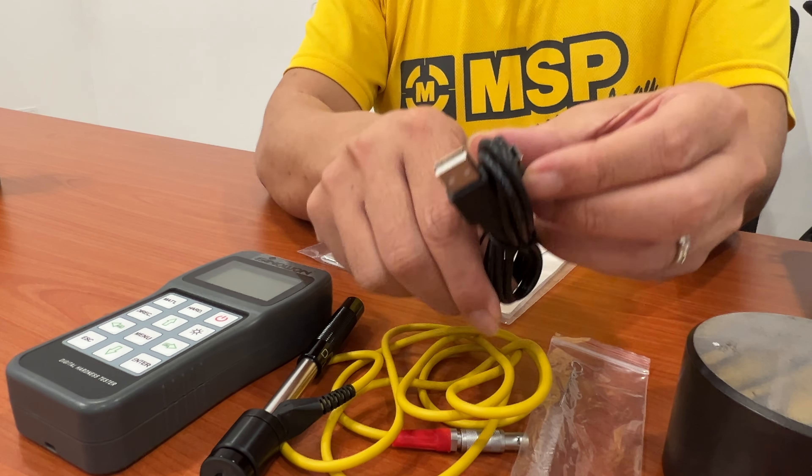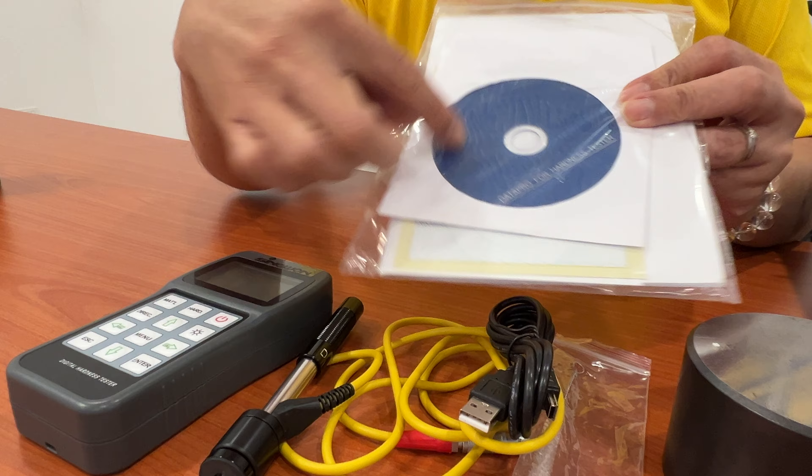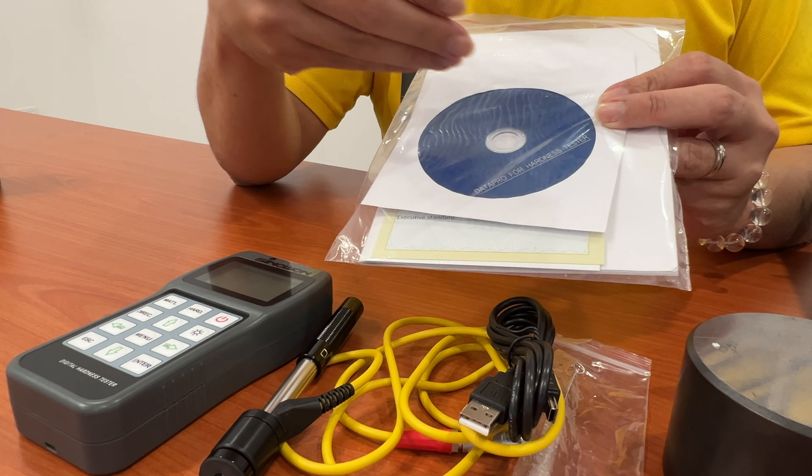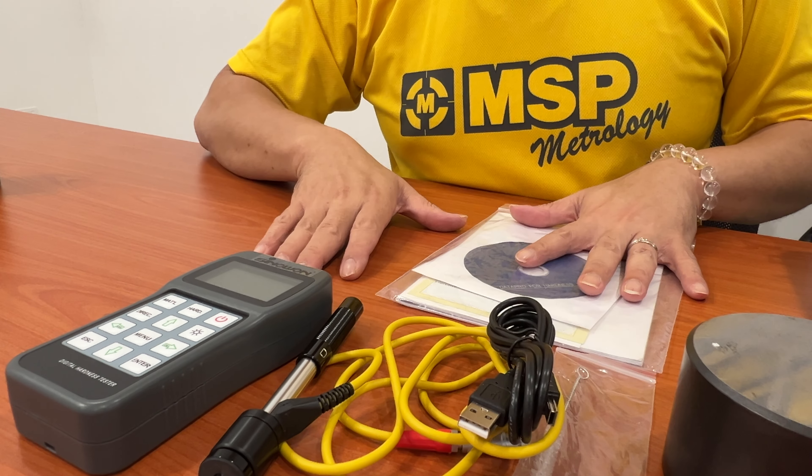The last item is the USB cable. We will provide the data software to transfer data from the equipment to the PC. So this is the accessory, and it will all be covered together.